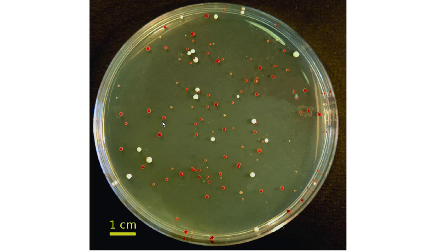I'm going to give you some data, and you can see how the patterns, how the trends look in terms of survival of cells overall and in terms of numbers of white cells as we expose the plates to increasing amounts of UV. So that is what you're going to do in the data analysis part. So I'll give you some sample data and you can analyze that data and make some conclusions.